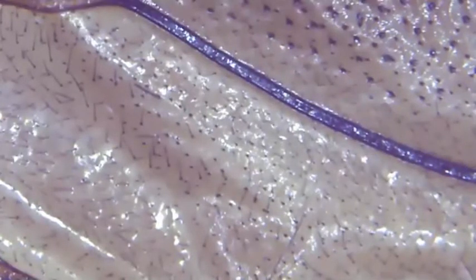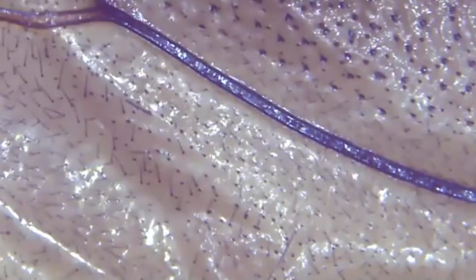Nipan, do you have an observation? Maybe it's inside the human body. Whoa, it kind of does look like that, right? Kind of looks like skin in a weird way. I would agree with that. Anyone else?